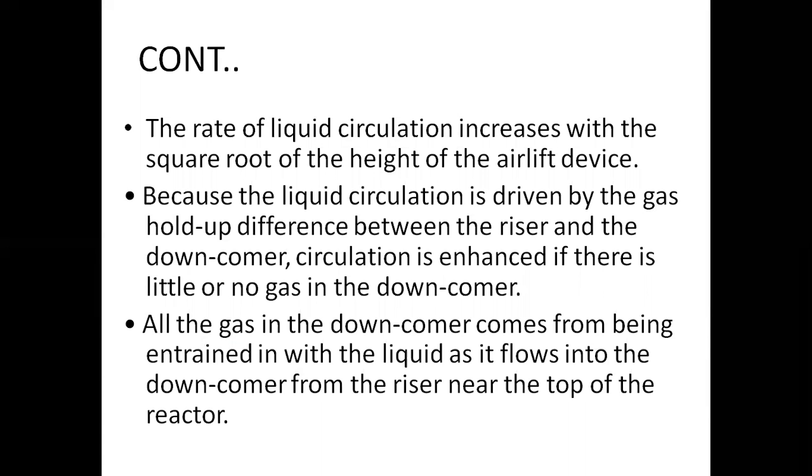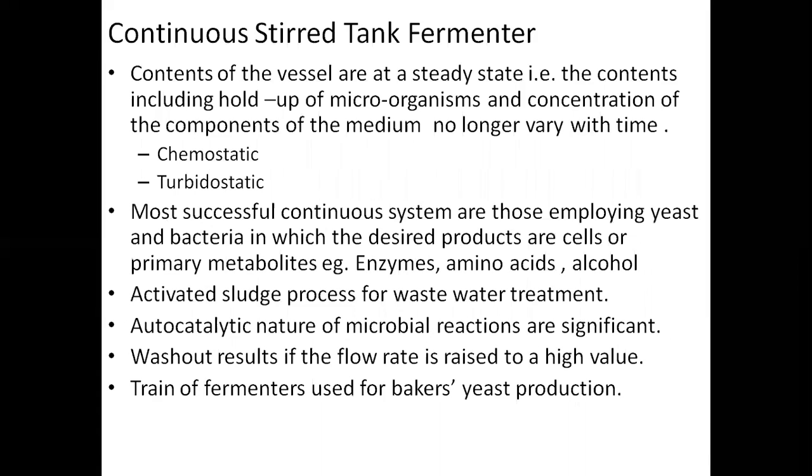All the gas in the downcomer comes from being entrained with the liquid as it flows into the downcomer from the riser near the top of the reactor. So basically we are not sparging any gas in the downcomer. Any gas which is coming to the downcomer is because it is entrapped in the liquid coming from the riser zone.